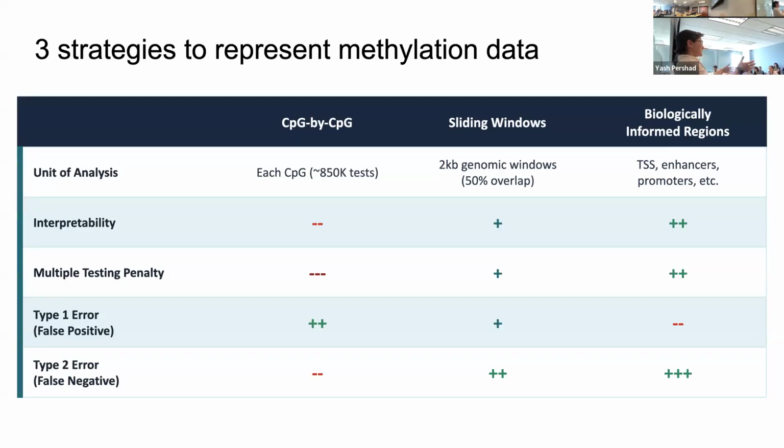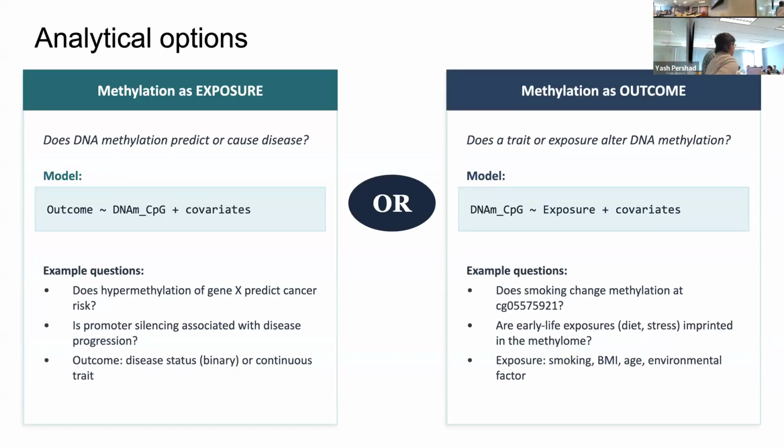Those might both be 50% methylated. Well, let's say the first one's 20% methylated and the second one is 60% methylated. If you collapse that with the EPIC array or something, you're just averaging, but that's not totally correct, because we actually have a different depth of sequencing, so different information. So you can then aggregate, arguably much better, to see the methylation in a particular region. Those are just some of the things to keep in mind when you're thinking about exactly how you want to parse methylation data and model it.